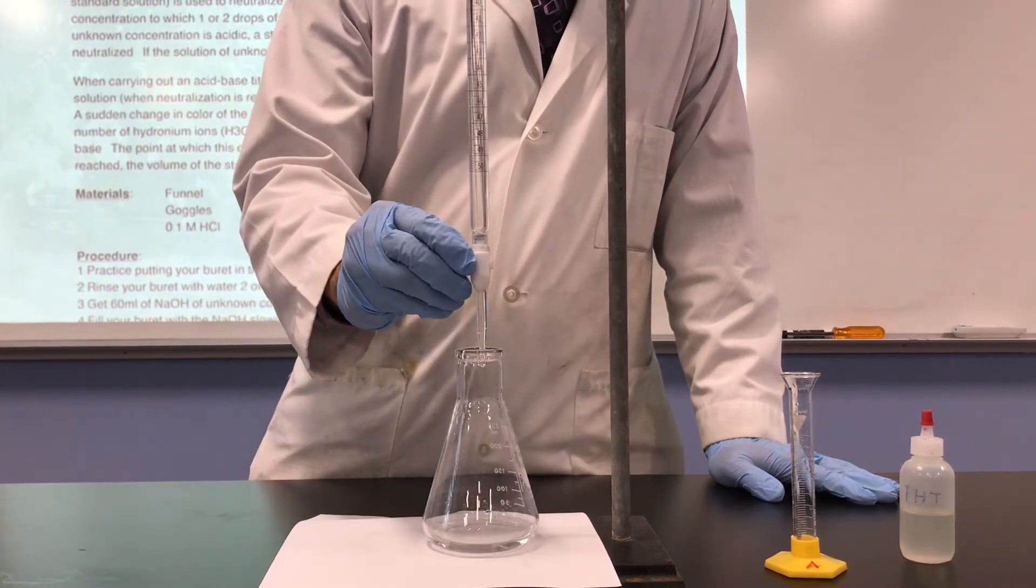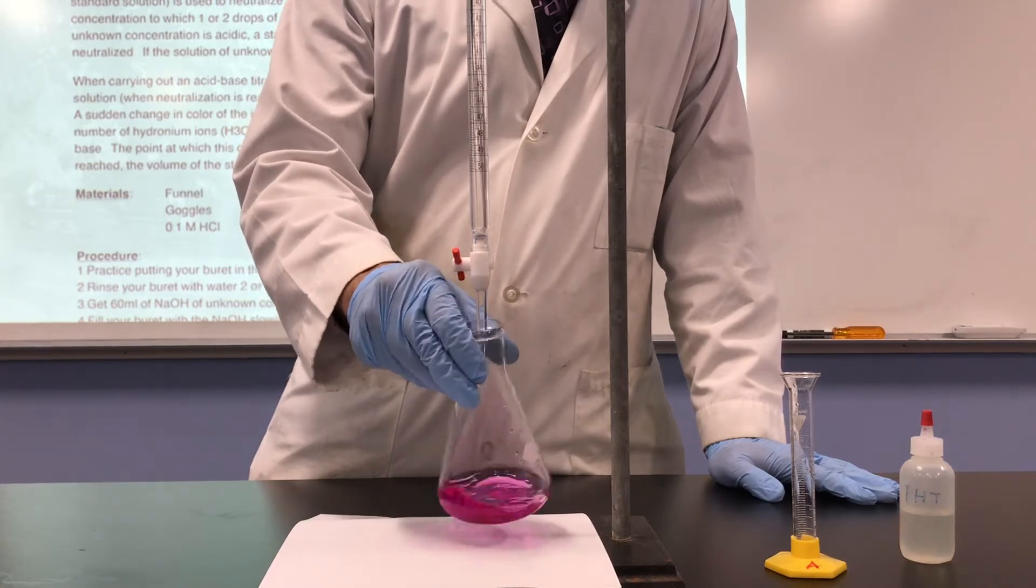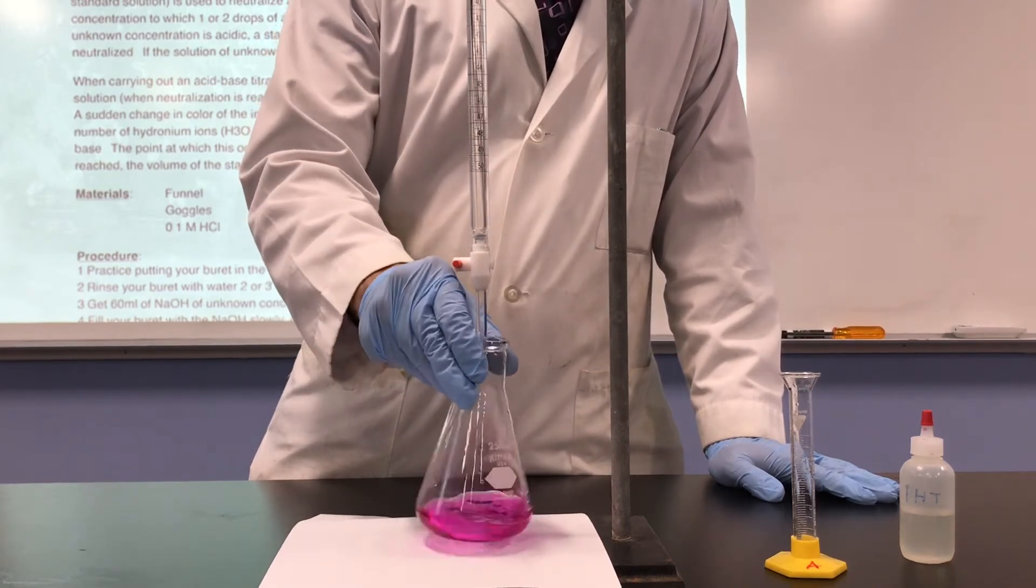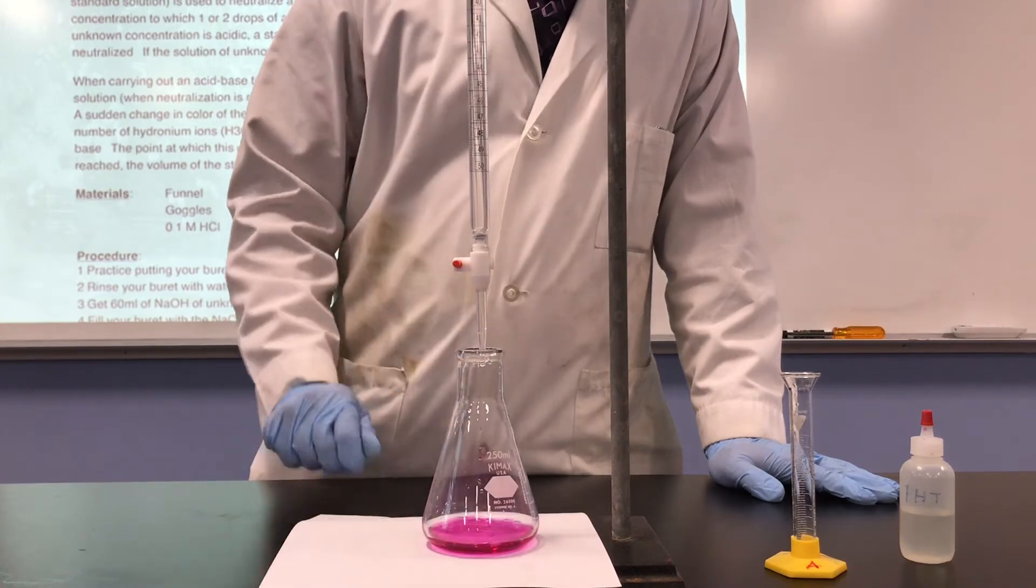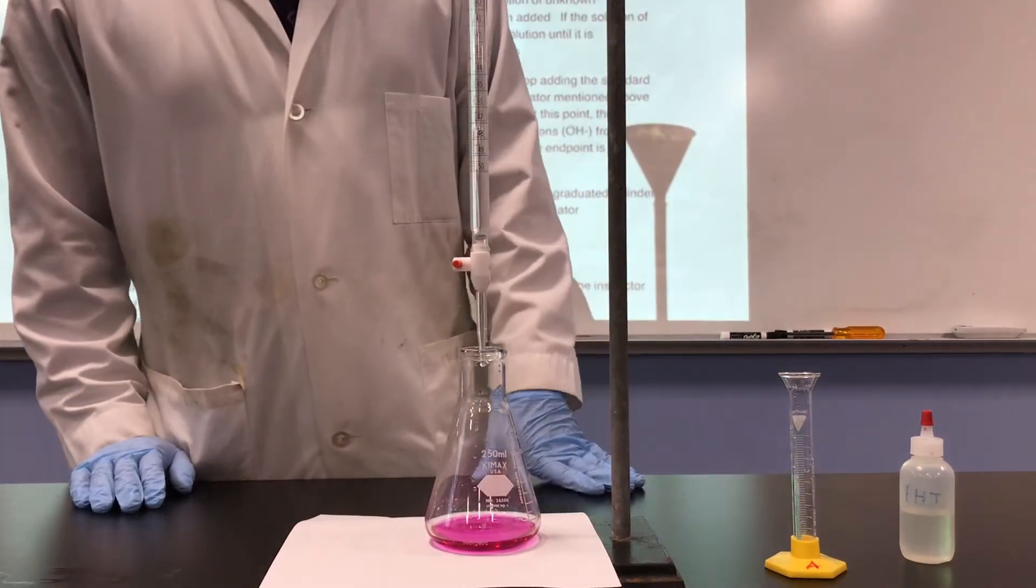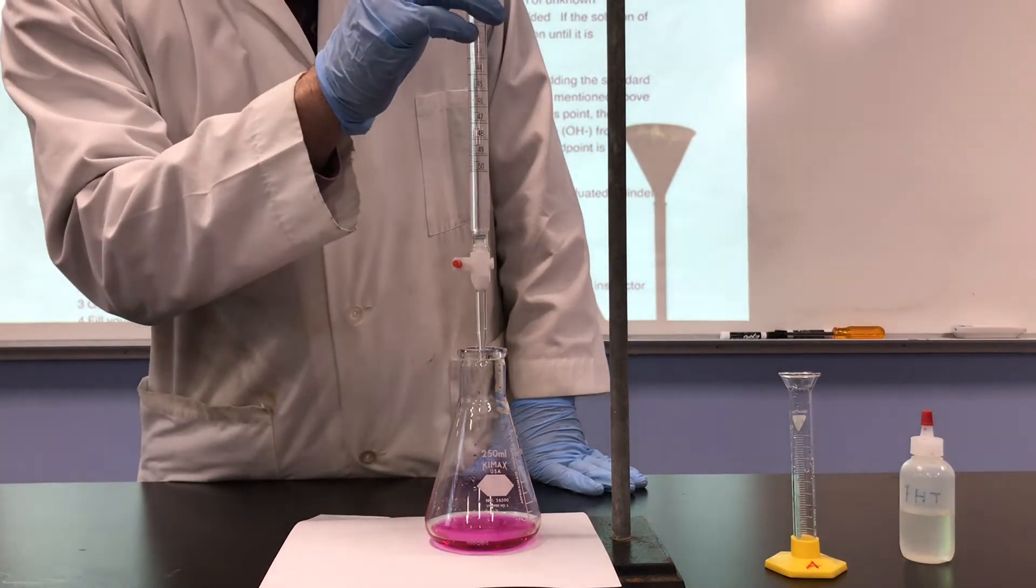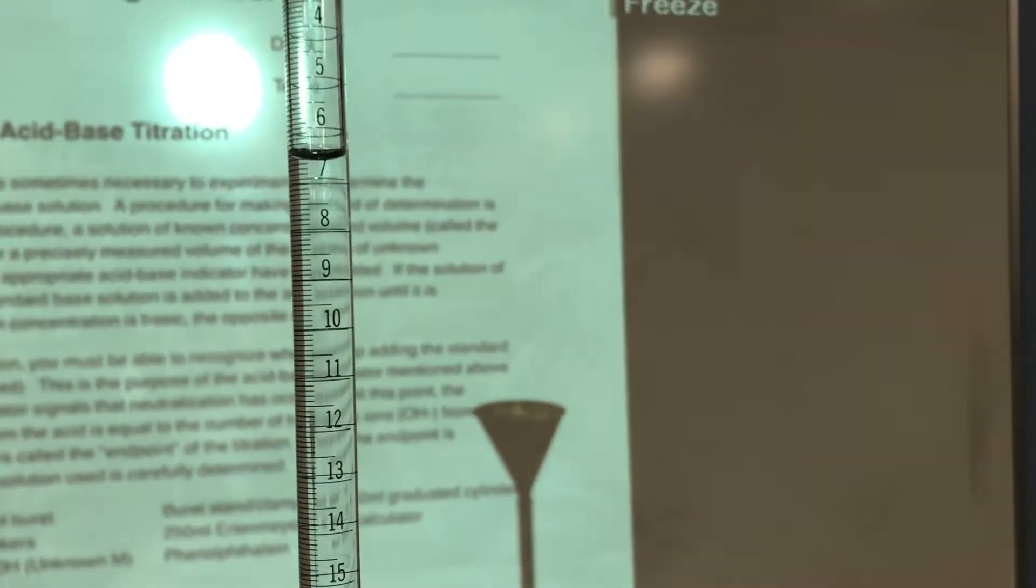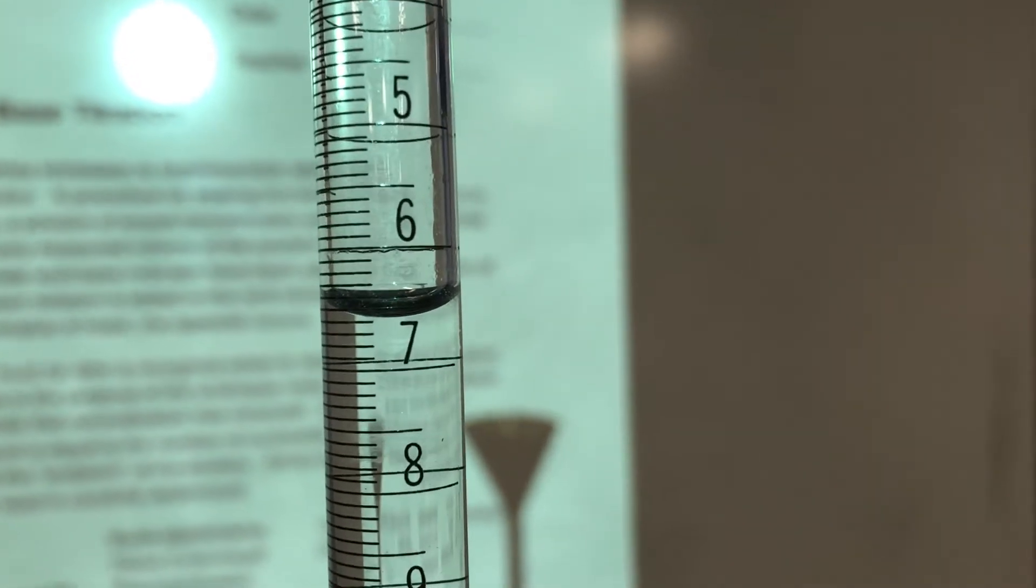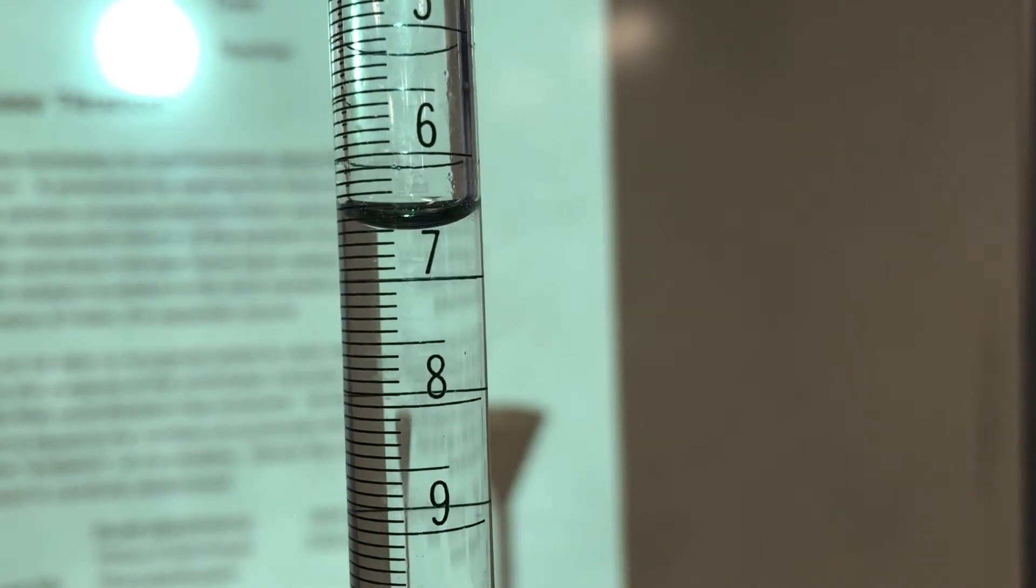So it stayed a little bit pinker for a little bit longer. So we're getting closer to our end point, and it looks like we just reached our end point. One extra drop turned us very pink. So we'll take a note of the reading, and then we'll be a little bit more careful next time. We'll slow down when we get closer to that number. After the first trial, we can see that we used 6.7 milliliters of base. 6.7 milliliters of NaOH in trial one.